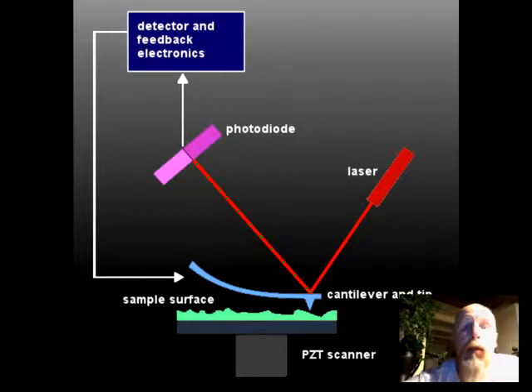The AFM is a useful tool for direct measurement of microstructures and parameters. The AFM can reveal the intermolecular forces of these structures at a nanoscale level, producing atomic resolution and characterization images. The basic principle of an AFM consists of a sharp probe at the end of a cantilever used to scan the specimen surface. The specimen sample is placed on a stage made of piezoelectric material that expands and contracts proportionally to an applied voltage.